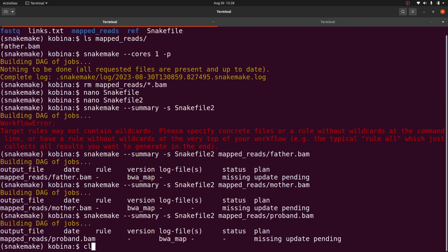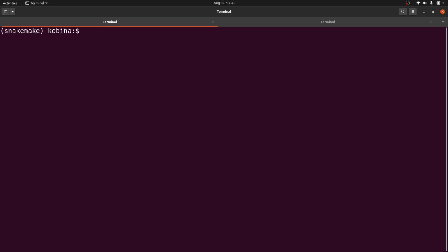Now let's do a proper action. Let's try to rerun Snakemake again. This time, instead of using father.bam, because we had already deleted that, let's use a different output. Let's use a different sample.